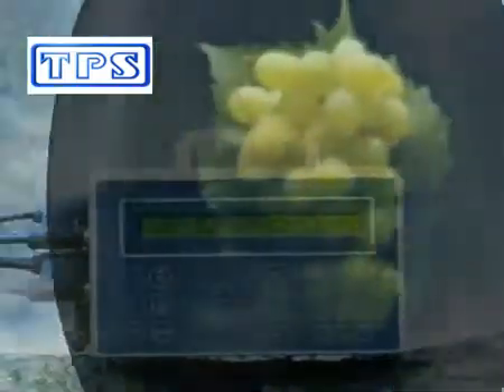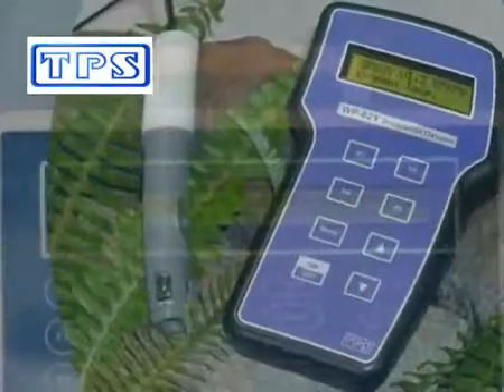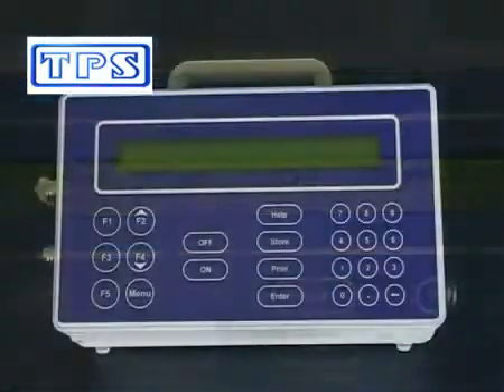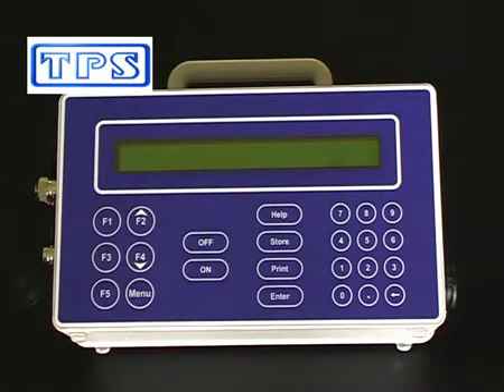TPS has been manufacturing reliable Australian-made water quality instruments for over 40 years to measure pH, ORP, dissolved oxygen, turbidity, conductivity, TDS, and more. The TPS 90FLT multi-parameter water quality instrument is ideal for short-term in-situ measurements.